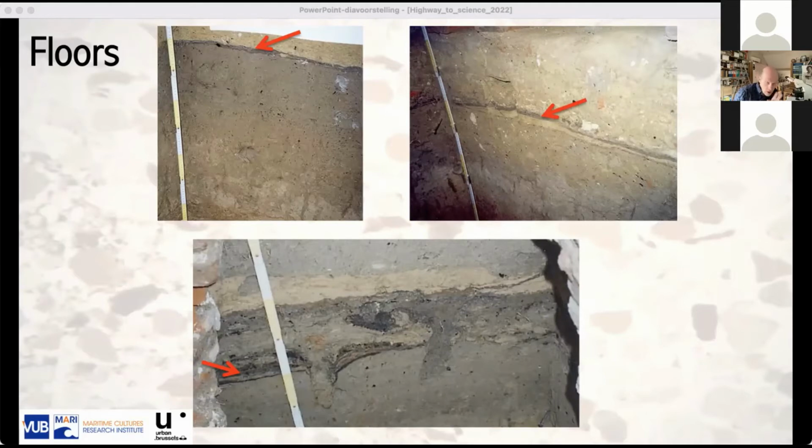Now, when we look at it, at first glance, these three pictures show us more or less identical deposits. But if we look at them under the microscope, we will see that they tell us three completely different stories, and that's what we're going to do now.